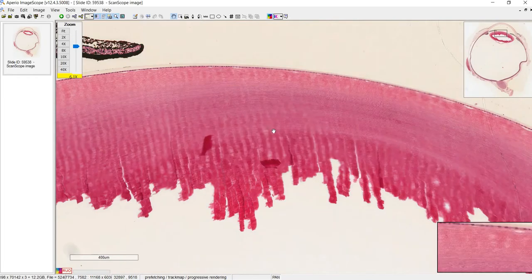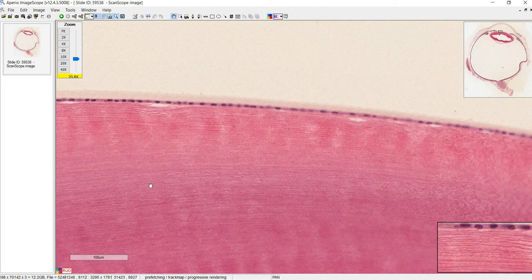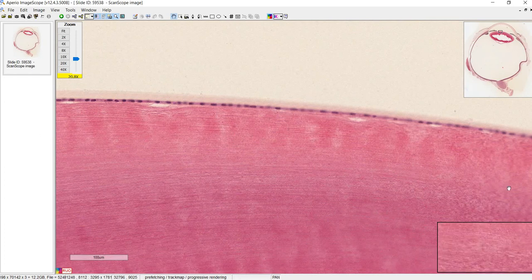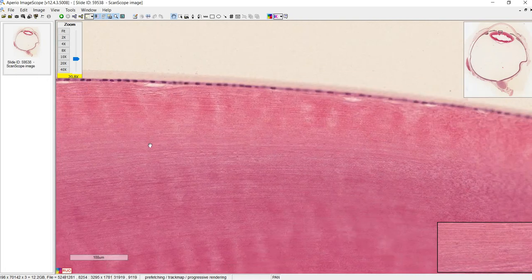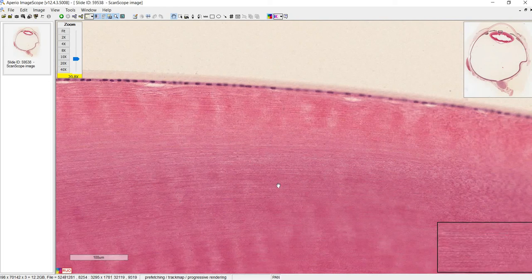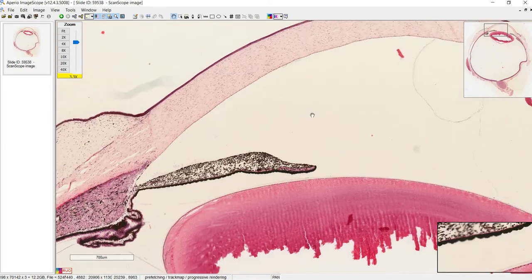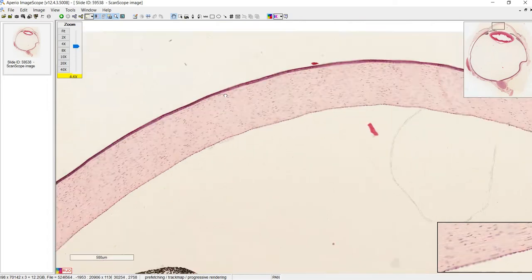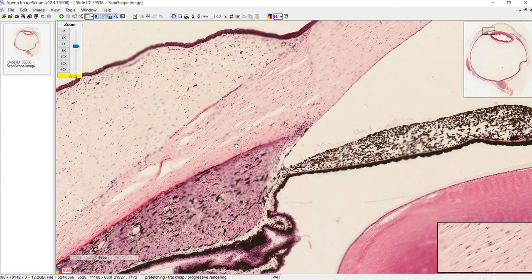Now let's talk about the lens. On the outer surface you can see one layer of epithelium, but deep to that the other cells have lost their nuclei and the cell bodies are arranged in concentric circles. Most of this material is crystalline. It's important to note that the lens is avascular — since it doesn't have a blood supply, it relies on diffusion of oxygen and nutrients from vascularized areas. The same goes for the cornea; if you look closer you won't see any blood vessels there.